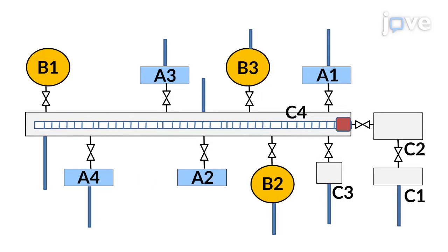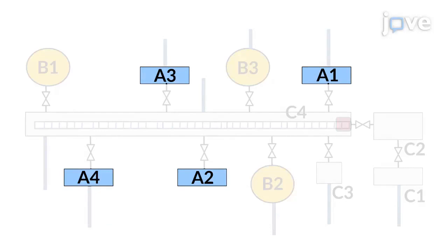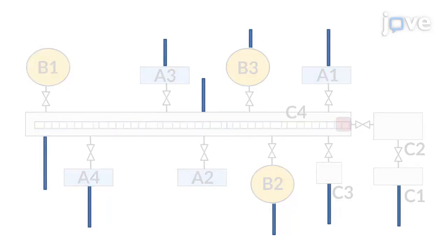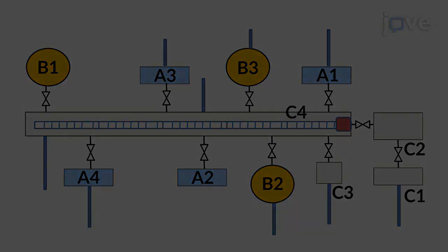The wagon and sample can be transferred between different preparation chambers, labeled B1 to B3, and analysis chambers, labeled A1 to A4. Transfer rods at each chamber allow conveyance of the sample holder to and from the linear transfer chamber.